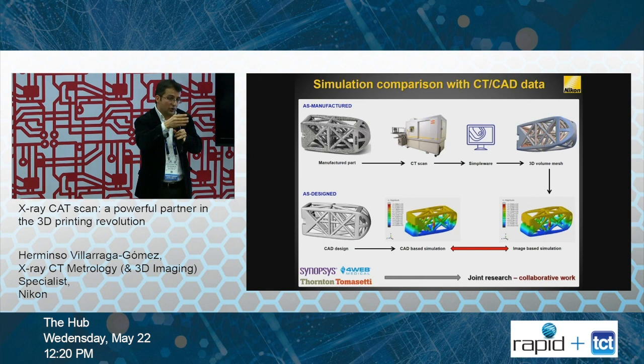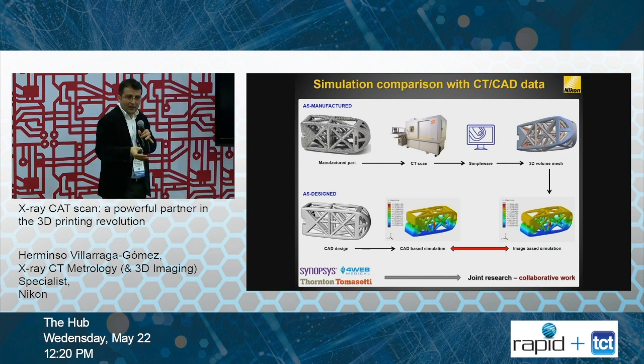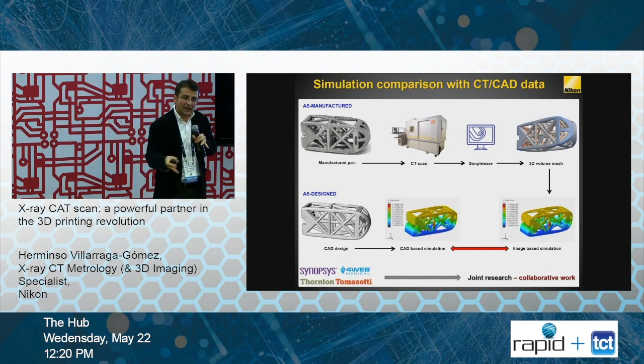And we have done it, not for this specific application, but for growing biological seeds. So we plant the seed, and because the growth is slow, it gives us time to scan. It grows a little bit, scan again, and it keeps scanning for 72 hours, and then after that you can create a video. And we call that 4D scanning because you have the 3 dimensions and the fourth dimension, which is time. So yes, it's doable. It requires some adaptation, and the 3D printing to be slow enough to go 360 degrees and keep checking.